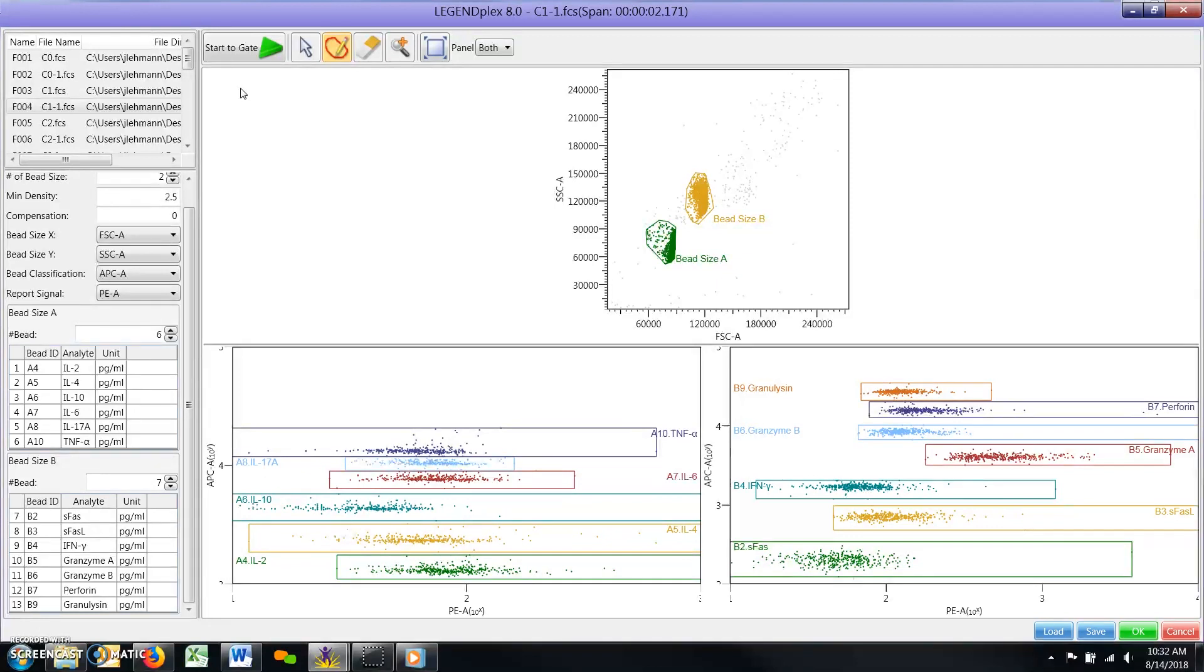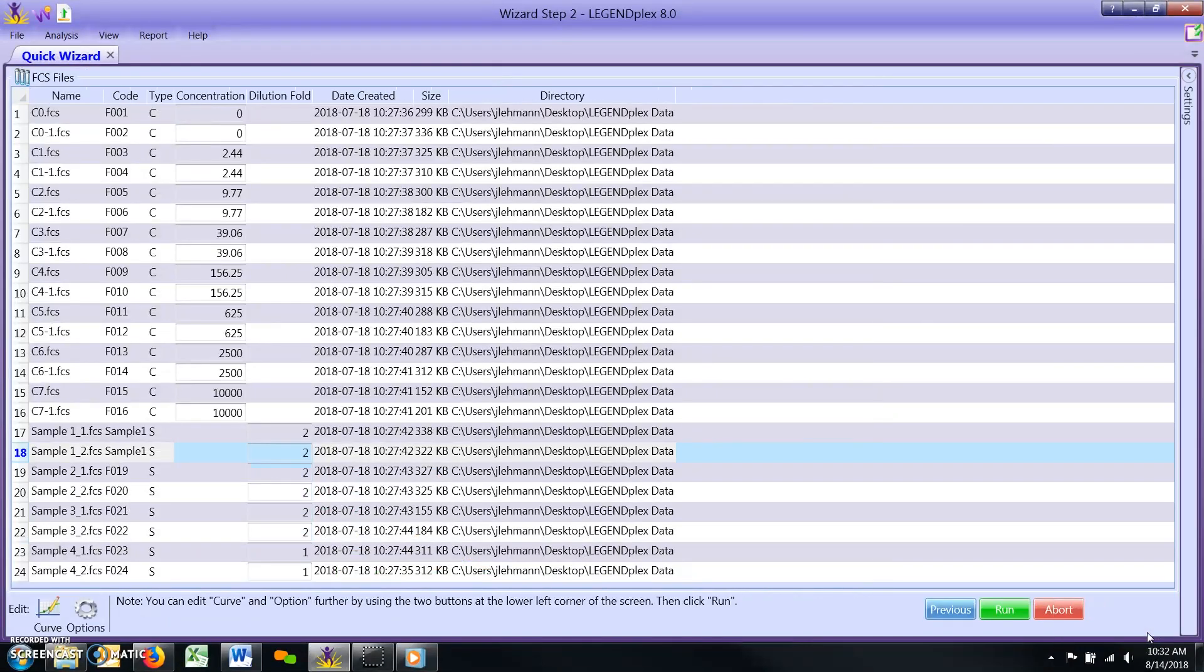When you are finished, click the green OK button found at the bottom right of the window to proceed to the next step of the analysis.